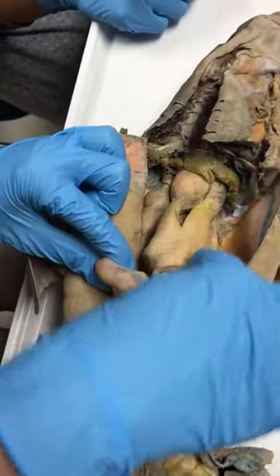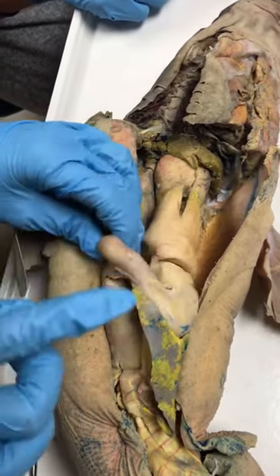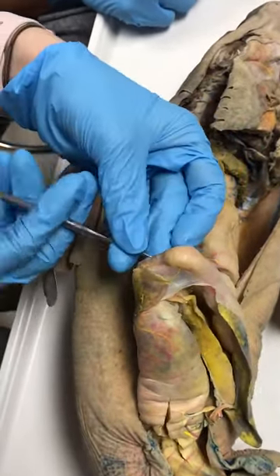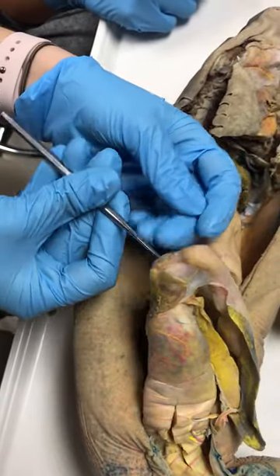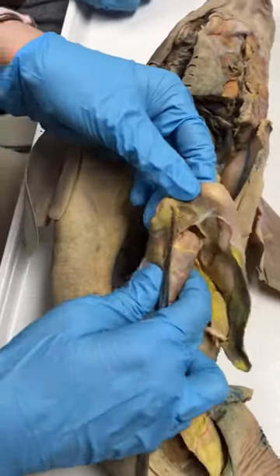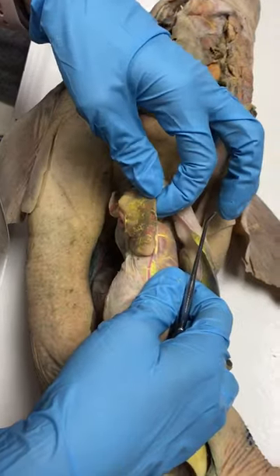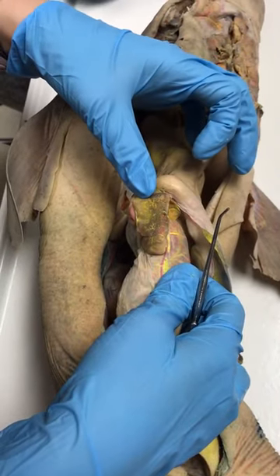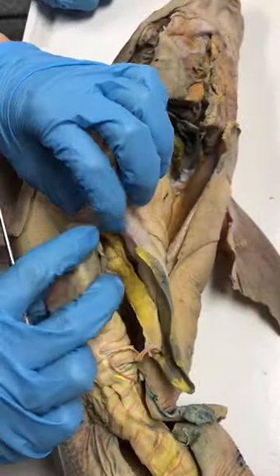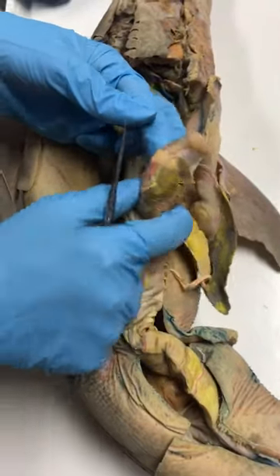The stomach is really skinny here, so this will be the pyloric region. Where it squeezes is the pyloric sphincter, and just like in other animals, right after that is the pancreas. At the beginning of the duodenum, after the pyloric sphincter, is where the pancreas is attached.